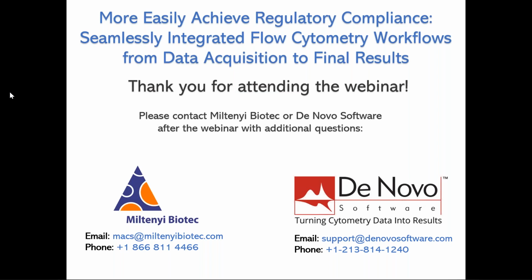Yes, I'm here. Excellent. So first off, as an application scientist, I'm not sure about the pricing, so that's something that we can always get the information for you. However, if you currently have a device that is RUO, presumably what you would want to do is order an IQOQ and then have the software upgraded to the 21 CFR Part 11 version. That's something that we have the capability of doing, and both of those will be done via our service team at Miltenyi.